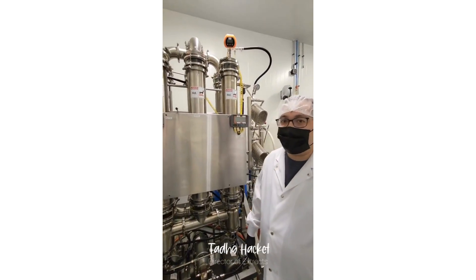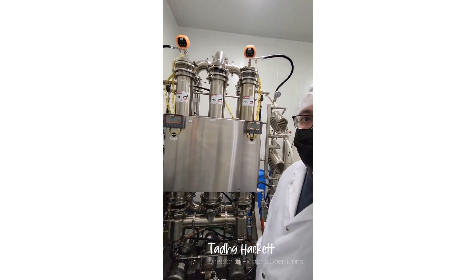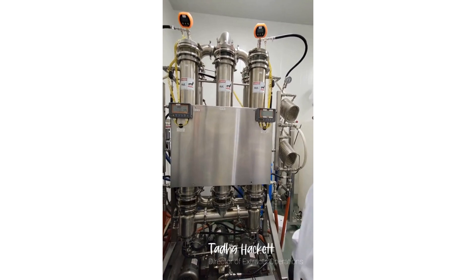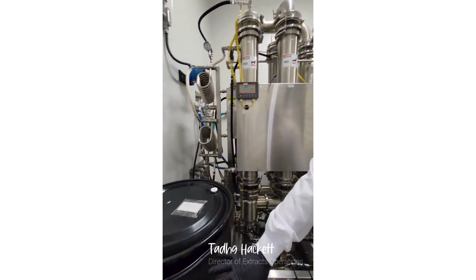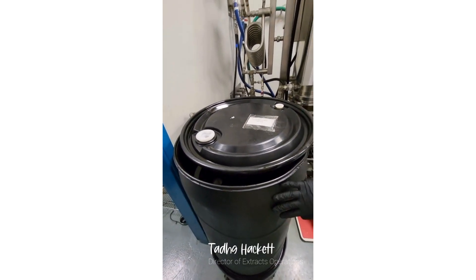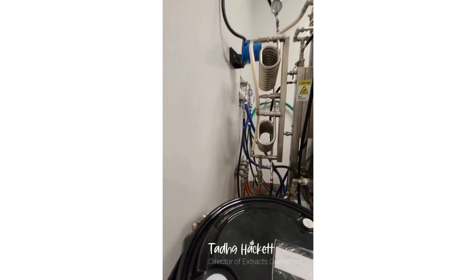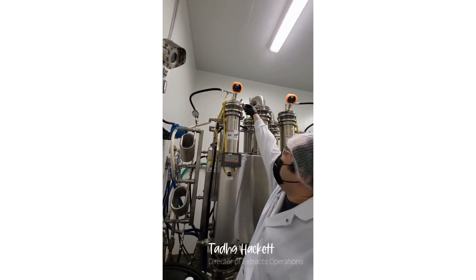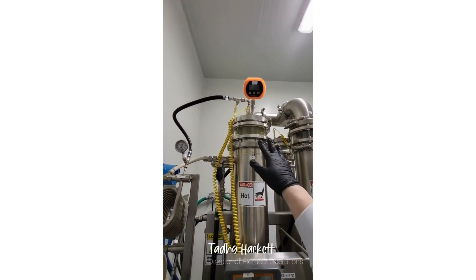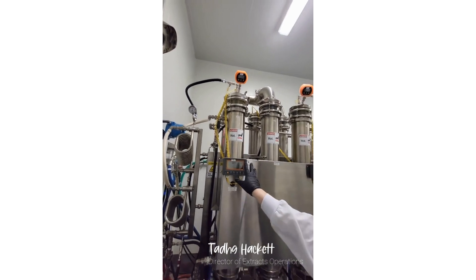This is our new falling film solvent recovery unit. We use it to recover the ethanol from our cold ethanol extraction. The way it works, it takes in the miscella — sometimes called the optimal tincture — from this barrel here, and then pumps it into the top here. You can see there's a spray coming out there, and that mixture flows down the outside of this column, which is heated by a water heater inside.